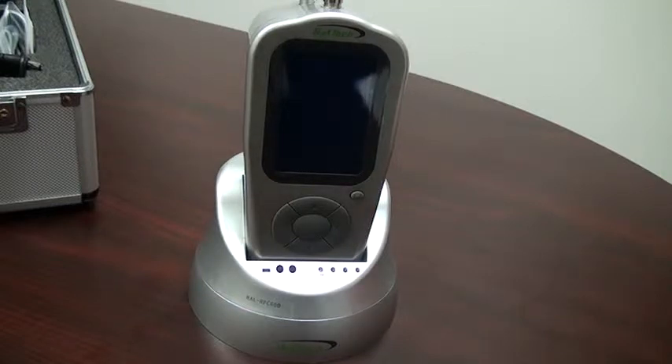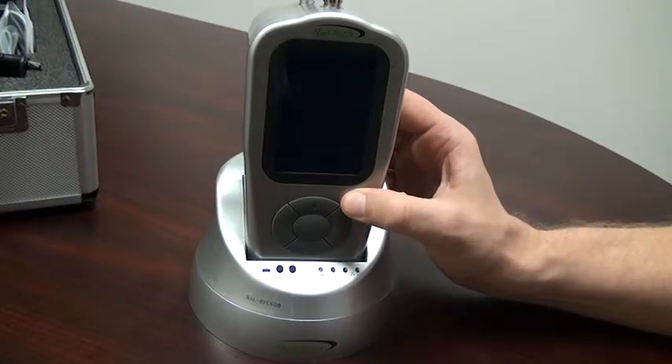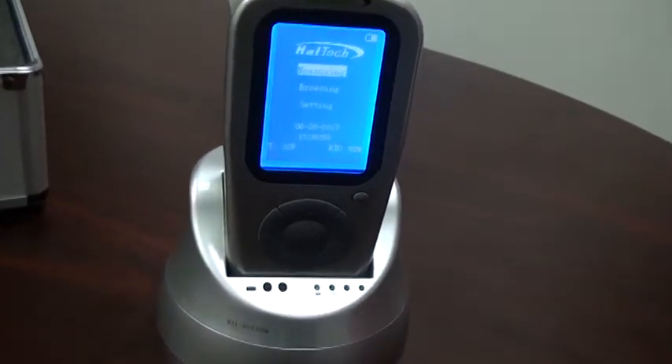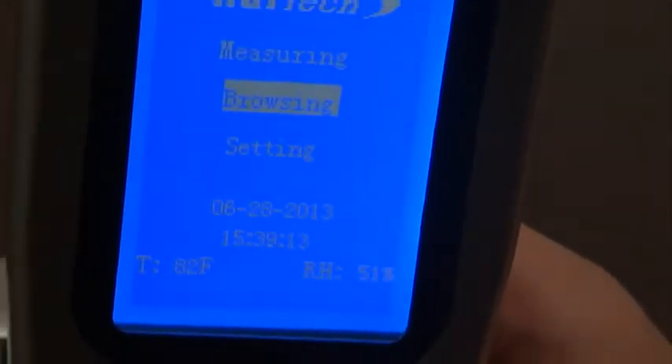To turn the unit on, we press the power button for a couple of seconds until we hear a beep, then let go. On the main screen, we see the measuring screen, the browsing screen where we can view historical data and print and delete that same data, and the setting screen. To move between the screens, we use the cursor key.